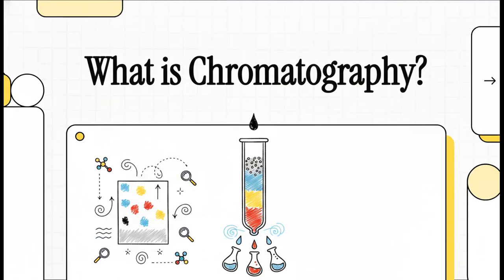I am so incredibly thrilled to have you here today because we're going to be decoding the invisible chemical world around us. We'll be looking at a truly foundational technique in chemical analysis, a process that's absolutely crucial to modern science, yet operates completely out of sight. Today, we're unpacking the general aspects of chromatography.